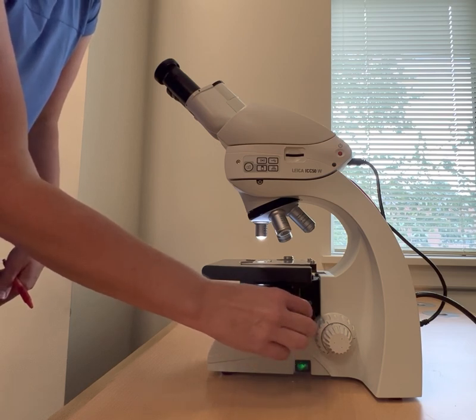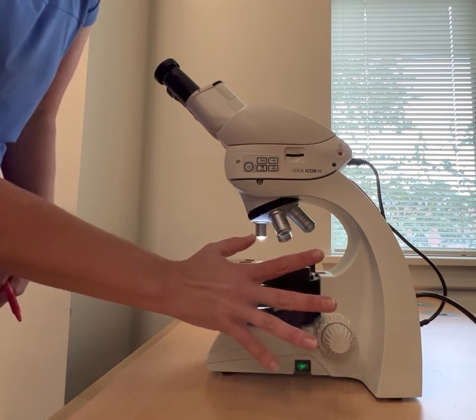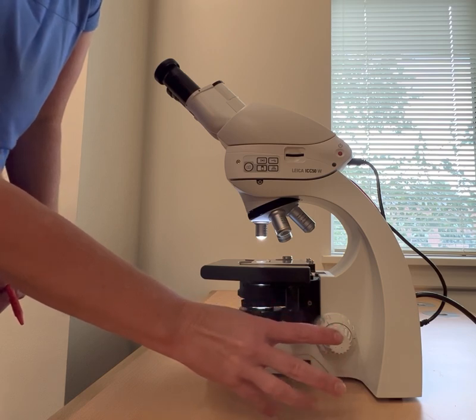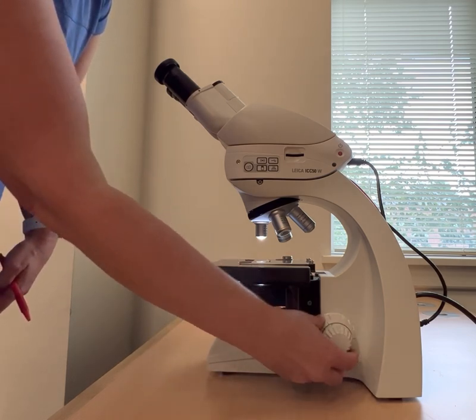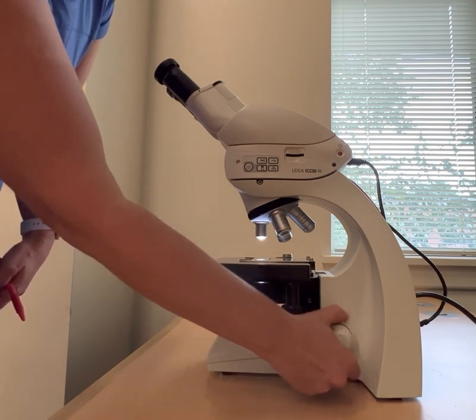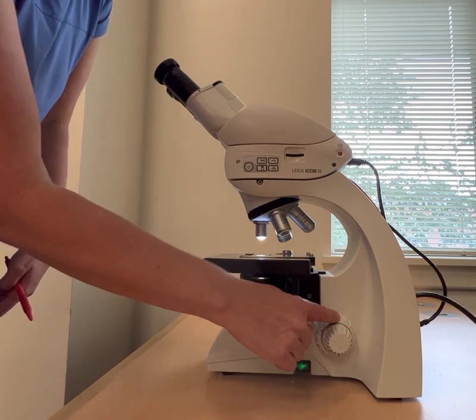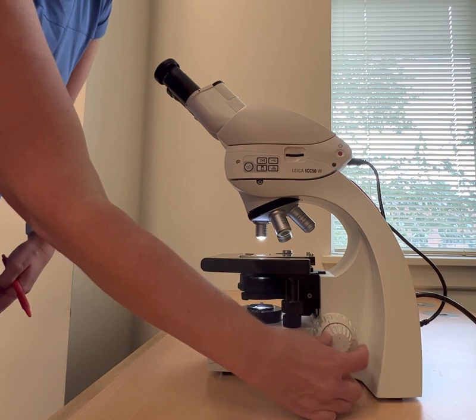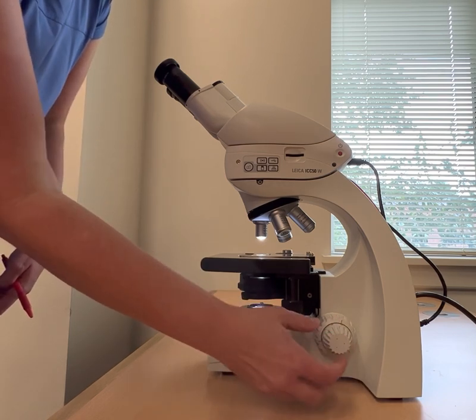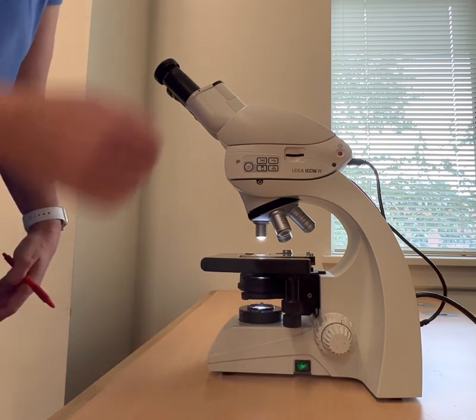And then last but not least, our very most important part when it's talking about moving and looking things through. This guy is your focus knobs, or your adjustment knobs. We have a coarse adjustment knob or a coarse focus knob, and then you have a fine focus knob. So if you look, I am making very large movements of the stage up on my coarse adjustment knob. And then the fine adjustment knob is going to be when you start to see it, but it's really not totally in focus yet, you go to this one. So this is your coarse adjustment knob. Your fine adjustment knob is right here.